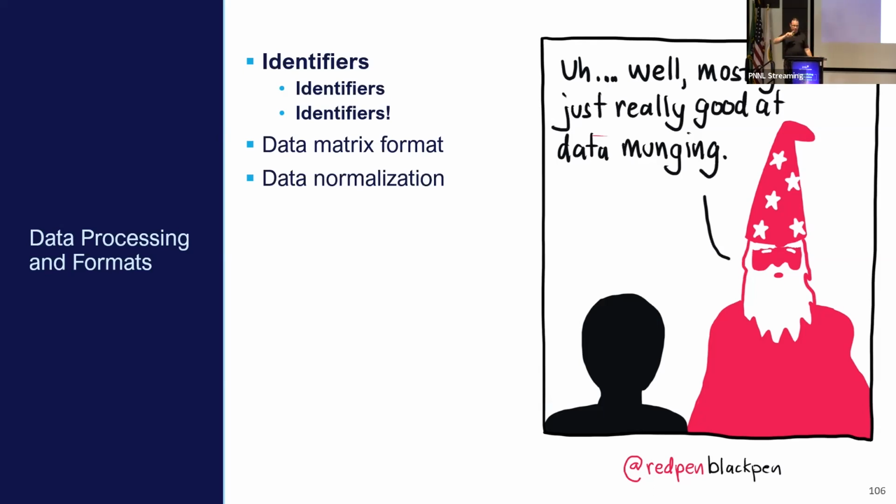Most of the tools that I mentioned above, especially the ones with web interface, will have things to filter out, like, hey, you've put in a list which we can't match to any of our database. And they also have translation tools. It's still not always an easy process to get your identifiers in the right format for particular pathway databases. And I'd say this is maybe extra true of bacterial data sets. And especially when you go into metagenomics and you're pushing out into territory that's not well annotated, that can be difficult.